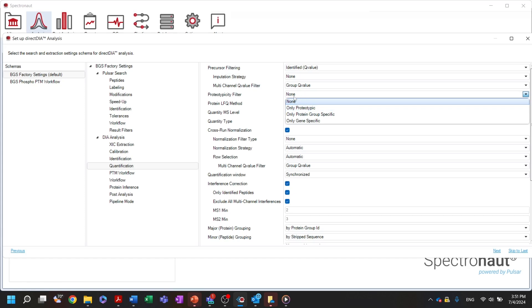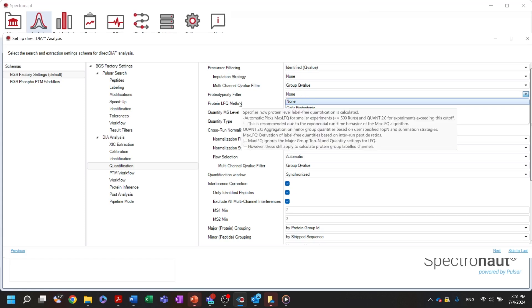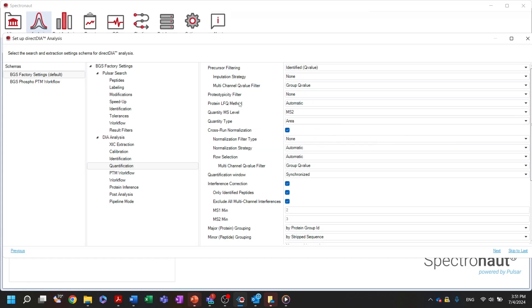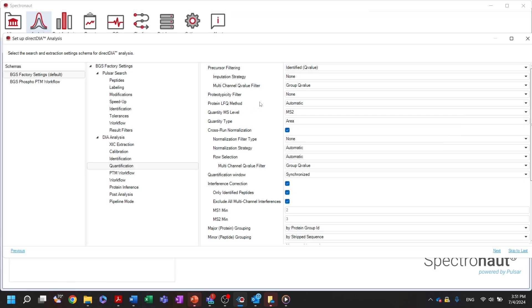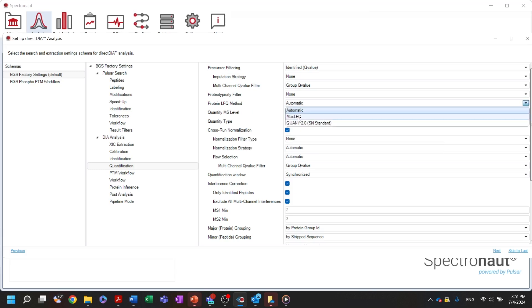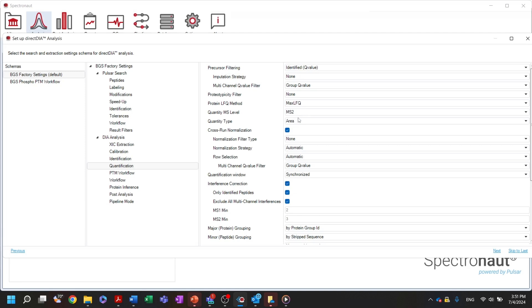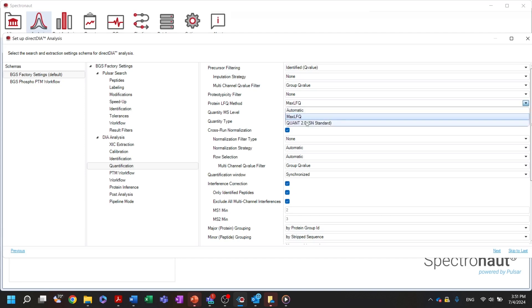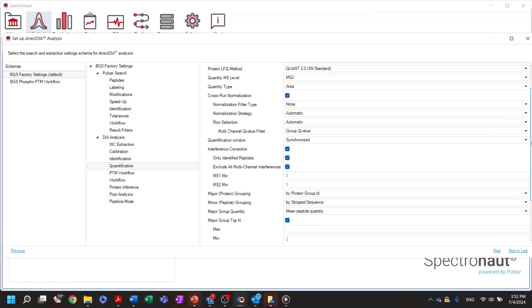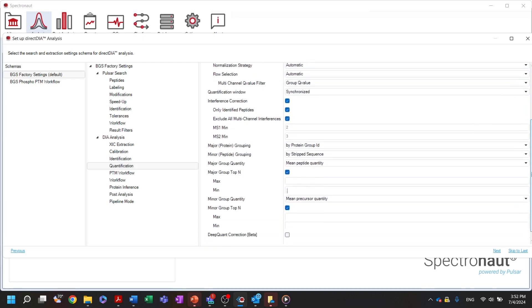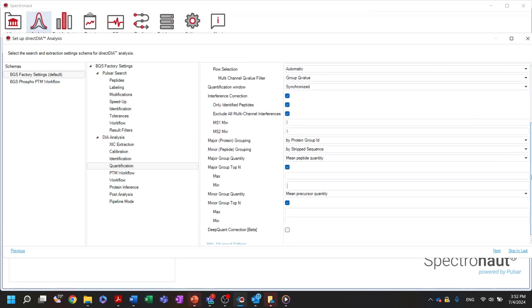Below, the LFQ method that will be used for protein quantification is defined. For a typical smaller DIA experiment, Spectronaut will apply the max LFQ algorithm. When the experiment size exceeds 500 runs, the top-end strategy, quant 2.0, will be applied. You can always change it to your preferred strategy independent of the experiment size. For quant 2.0, you can specify how many top-end peptides will be actually used for protein level quantification.